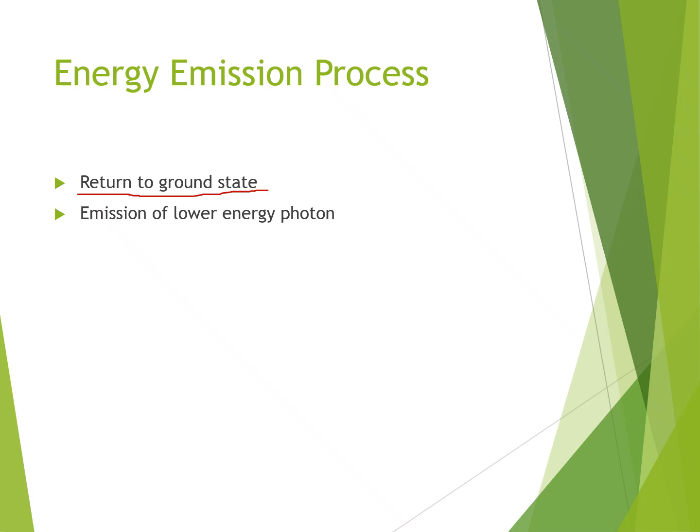The photon has lower energy because some energy is lost as heat through vibrational relaxation, and as a result the photon has longer wavelength than the absorbed photon. So it is very clear from the energy emission process.